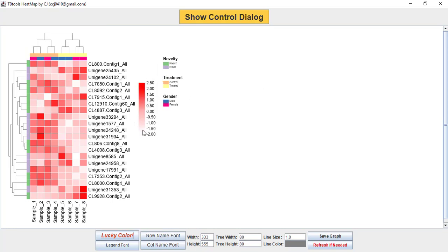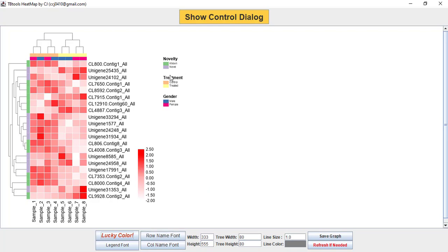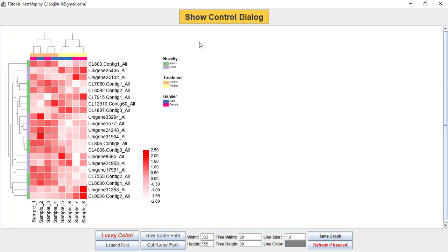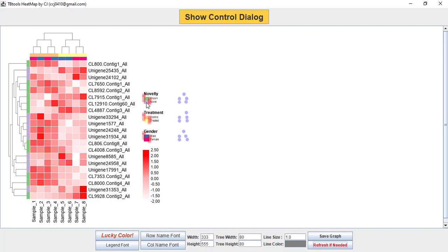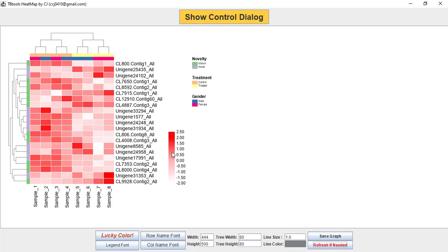Similarly, you can arrange the legends just by pressing and dragging to wherever you want to put them. You can customize these graphs according to your requirements. You can also change the width and height of your heatmap just by increasing the number — here I am putting 444 by 500, then press refresh. Now you can see the graph width and height have changed. You can arrange the legends as you like.